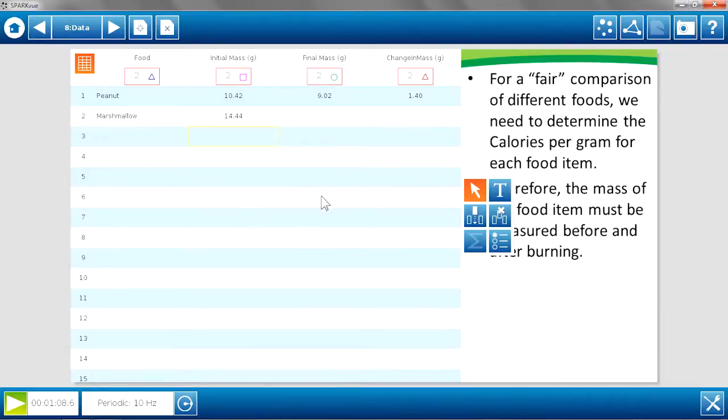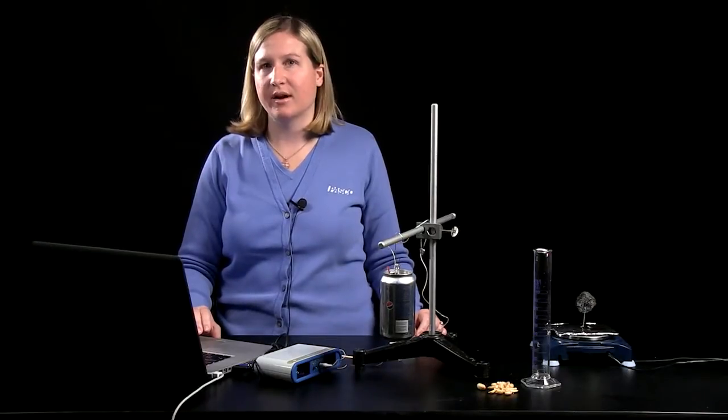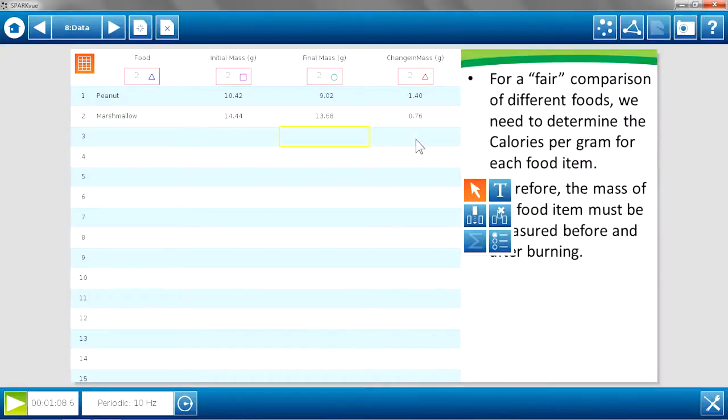Place the food and holder again all together on the balance. And I'm going to return to my data table for collecting data on mass and type in the final mass here, 13.68 grams. And I'm using a data table in which the third column change in mass automatically calculates the difference between the initial and final masses. SparkView software has a calculator option and I use that to create an equation that will find the difference.